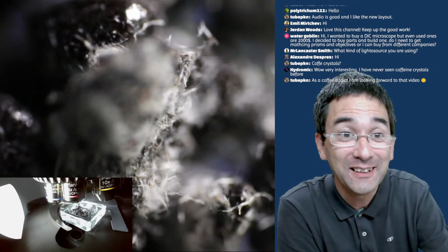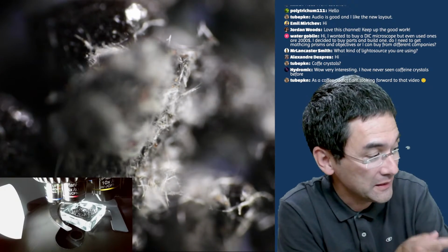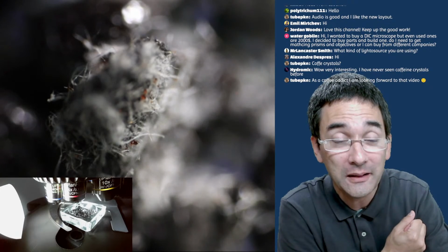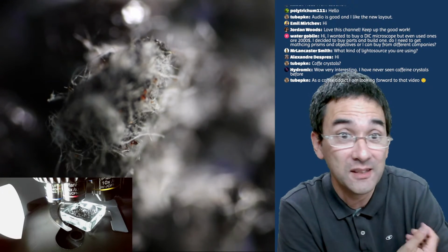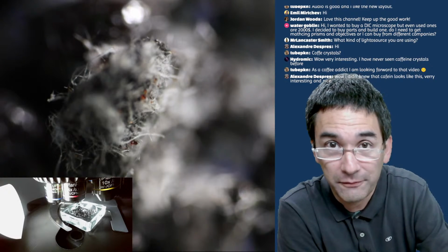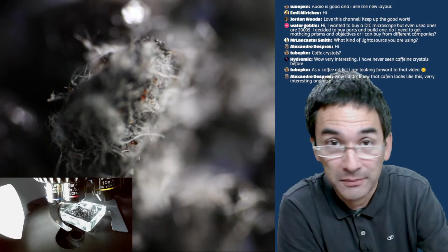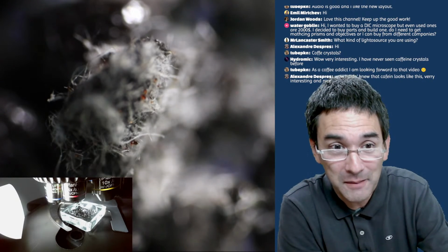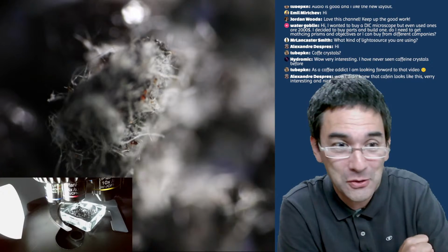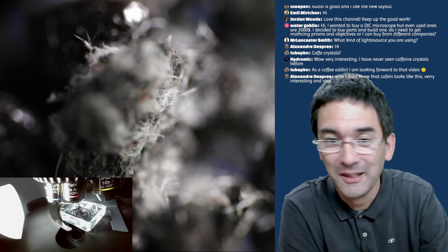Yes, they actually look quite nice under polarized light. So what I've done is I've taken a little bit of this instant coffee, put water into it, and then the white fuzzy stuff disappeared. If it were cells like fungus or mold, then of course I should be able to see the cells and the spores. Nothing like that. It disappeared, and I scratched off some of this white fuzzy stuff, and I could see it dissolve under the microscope and then recrystallize.